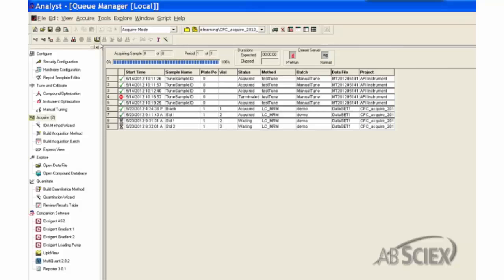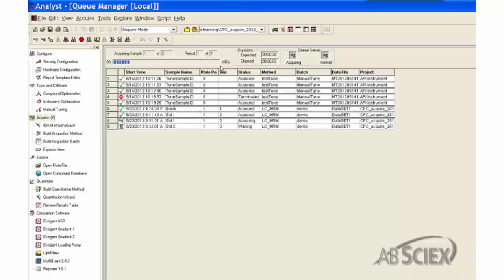At this time, the System Status turns from Ready to Pre-Run for Sample Injection and then to Acquiring as it begins acquisitions of the samples. The Sample Acquiring progress bar shows the real-time analysis status of the current sample. The sample status in the queue also changes from Waiting to Acquiring.